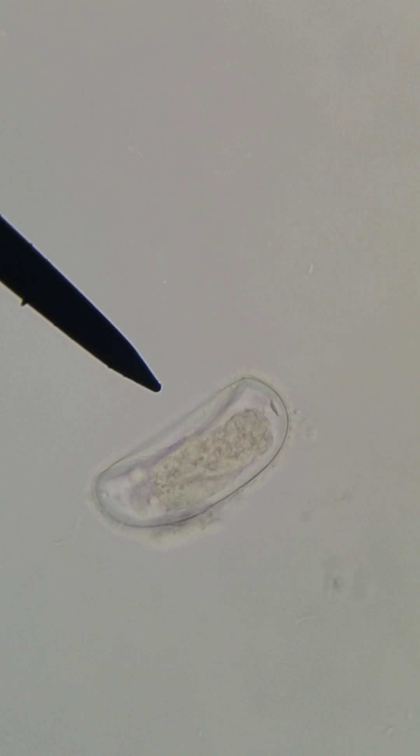There's an Enterobius vermicularis egg right there. It's got a flat side. On the upper part next to my pointer, it's got the developing larvae inside. And there's a space in between so you can see the thick outer shell. So it's transmitted by self-infection, and person-to-person can also happen if there's contaminated clothes or bed linens, maybe even carpets. The developing larvae inside the egg becomes infective in four to six hours under optimal conditions.